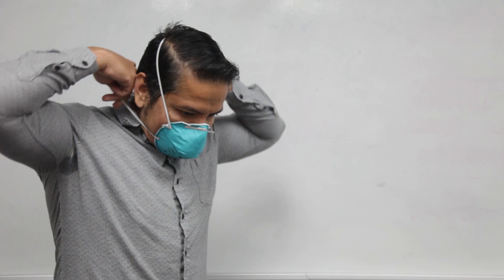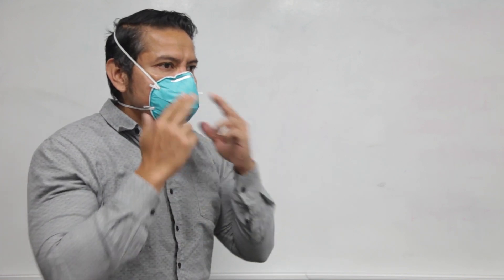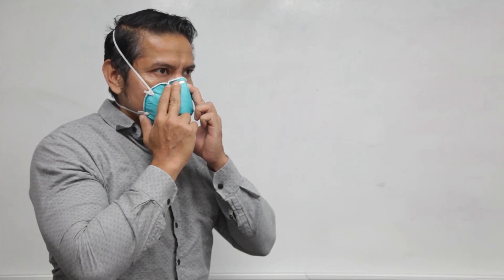Finally, untwist the straps, positioning the mask low on your nose, and use both hands to mold the nosepiece over the bridge of your nose and face so that it fits snugly below your eyes.